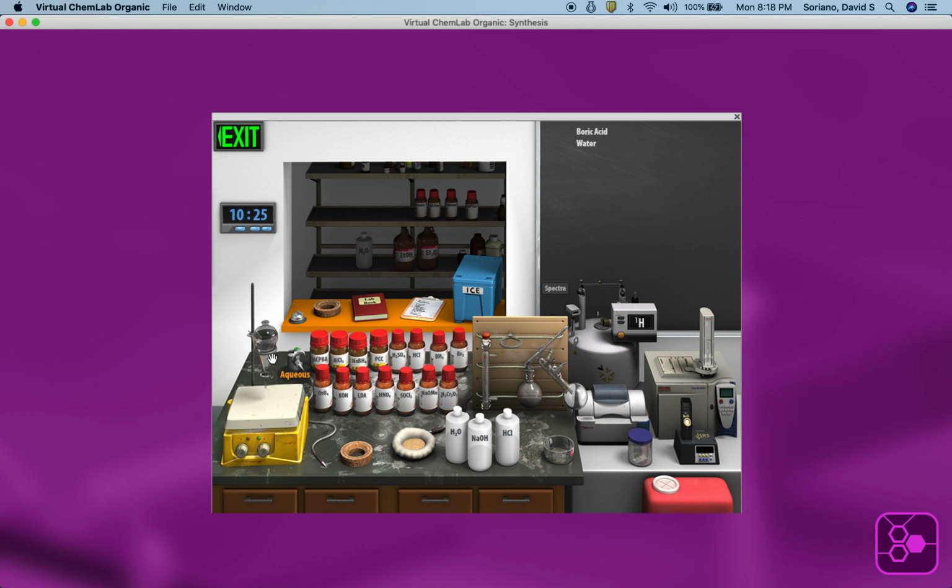So we're going to take this right over to, let's say, the evaporating dish. The ether will be gone. We don't have to distill the product, and it's in there. Now, would that be a solid? Well, let's see. Let's take a melting point and see if we get anywhere with that.